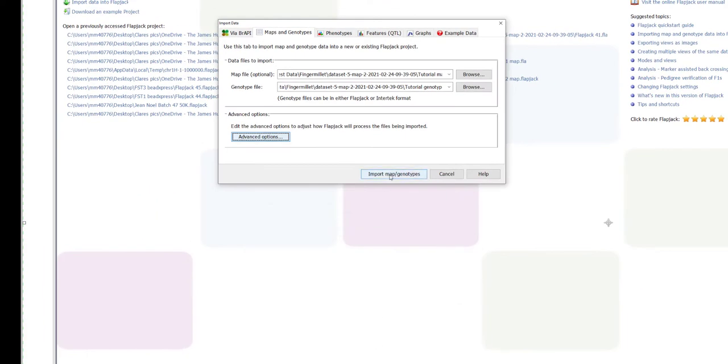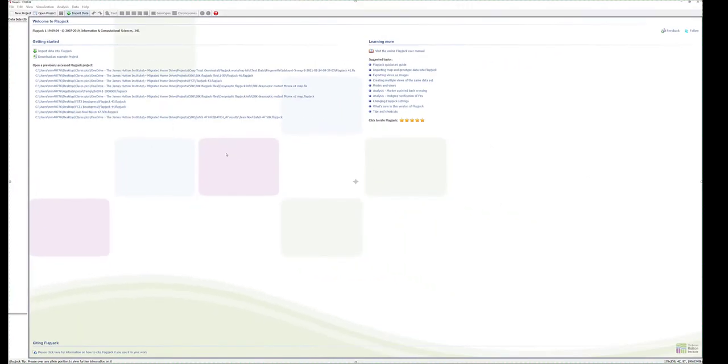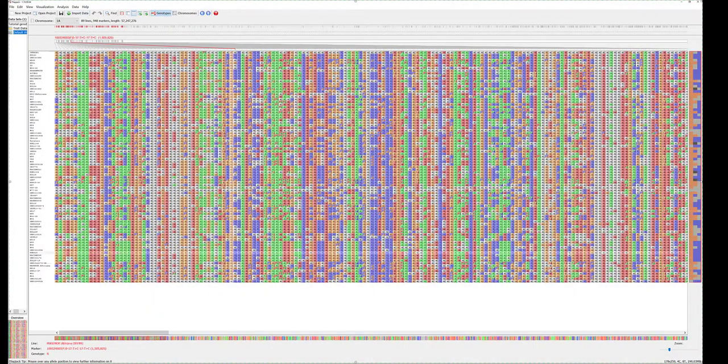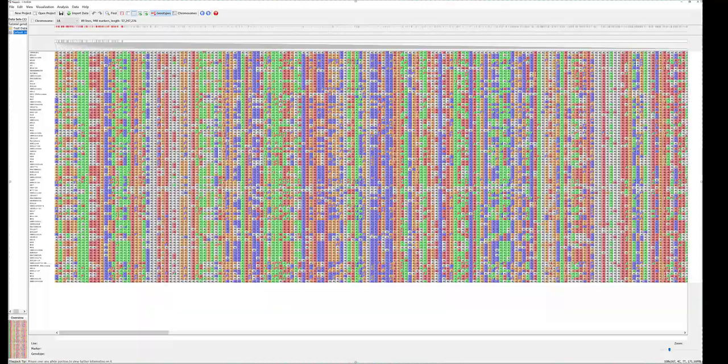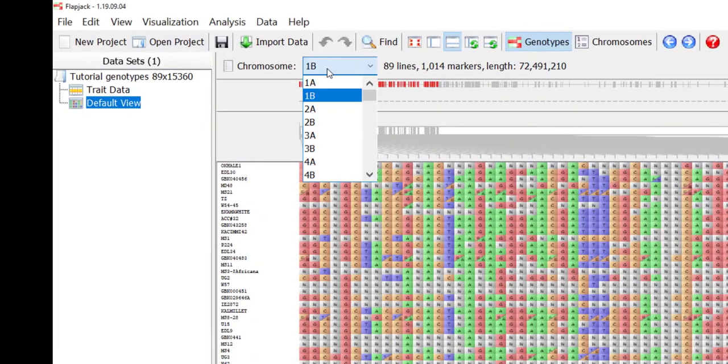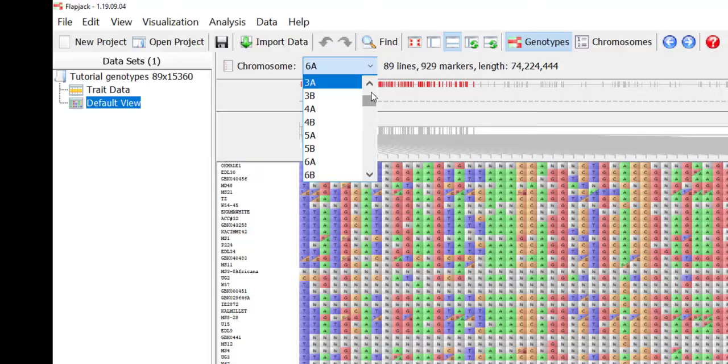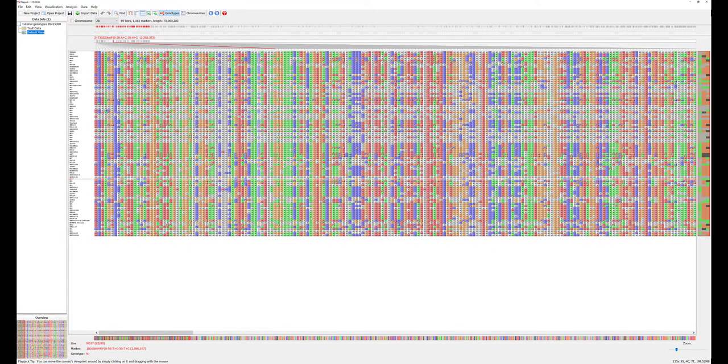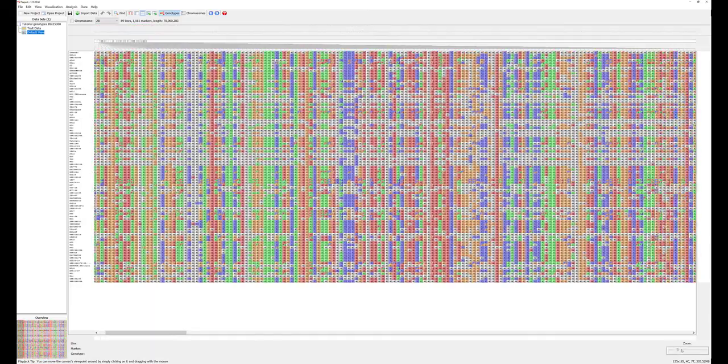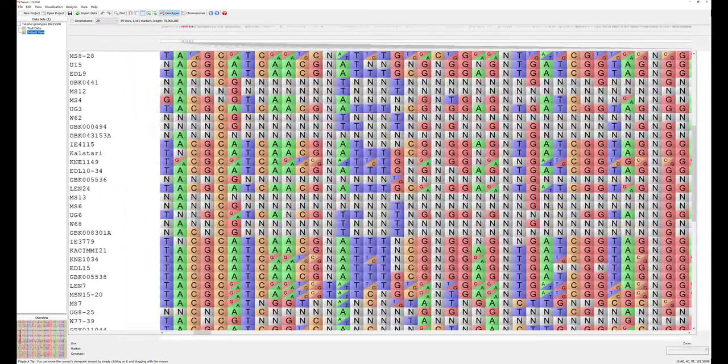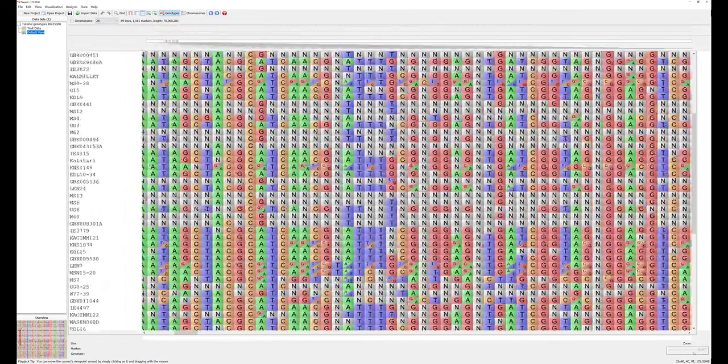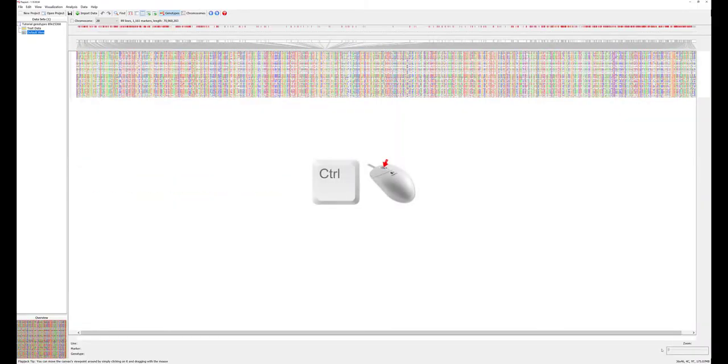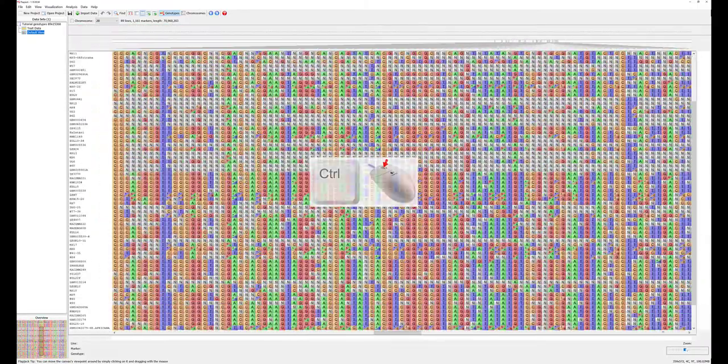We can now click import to create a project. So now we can start to examine our genotype data. Different chromosomes can be viewed using the chromosome pull down menu and it's possible to zoom in and out of the genotype view using either the zoom bar at the bottom right hand side of the Flapjack window or using your mouse scroll wheel with the control key held down.